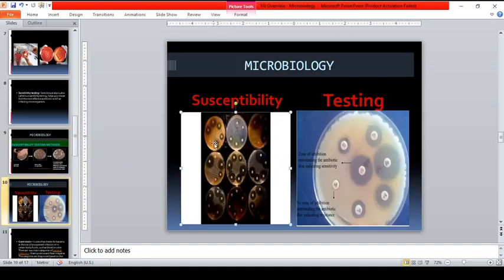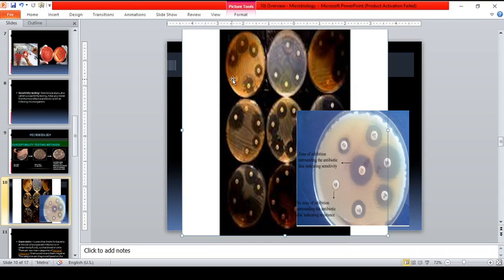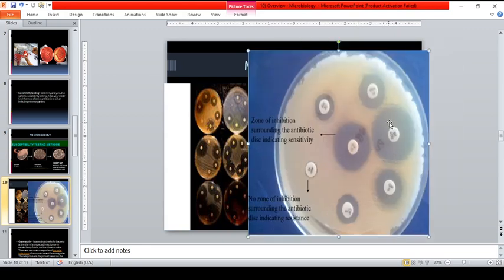So we have here different samples. As you can see, guys, the different antibiotics react differently. Yung iba, maluluwang yung zone of inhibition. Yung clearing na nangyayari. Okay? So, let's just use the other image for reference since that is clear naman. Since these are different antibiotics, the bacteria react differently with the different types of antibiotic.